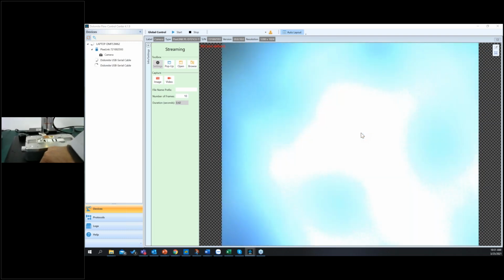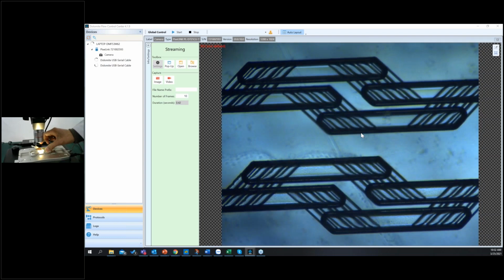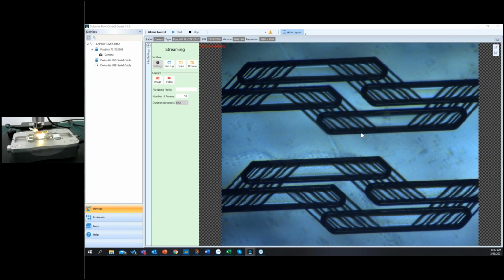Another type of chip I would like to introduce here is the micromixer chip. The micromixer chip is very useful when you want to increase the output of the process. As you can see here, it shows the chip junction and chip channels under the microscope. It is created by multiple channels, which can increase the mixing ability of the fluid while running through the chip.